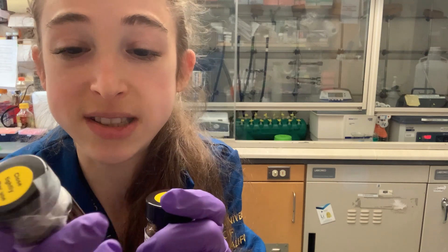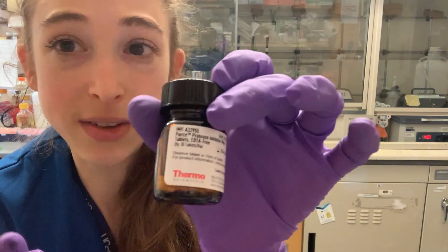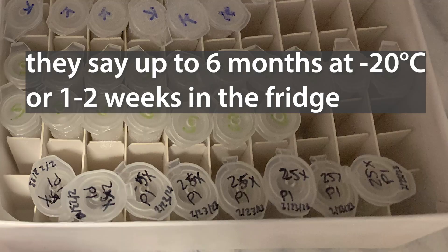One of these tablets — the normal size ones — is for 50 mils, and you might not have 50 mils of sample. Even the mini is still like 15 mils. So if you have less, what you can actually do is make a more concentrated stock solution and save that stock solution in the freezer. They say in the freezer it can be good for up to about six months. If you want to keep it in the fridge, that'll be good for a week or two.